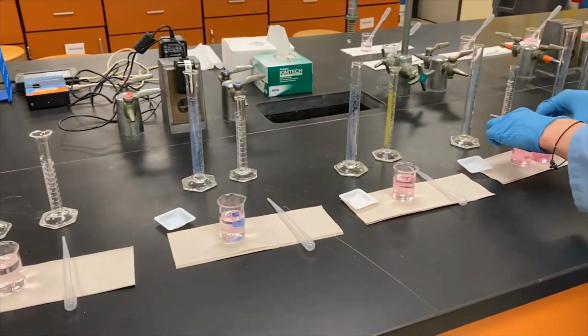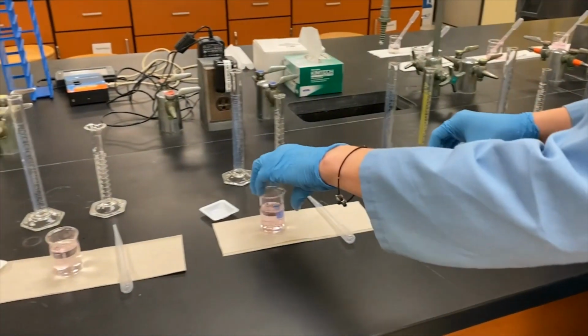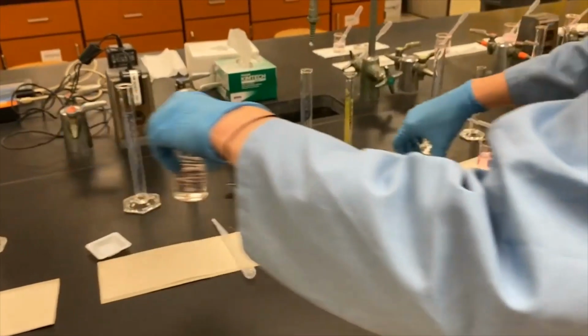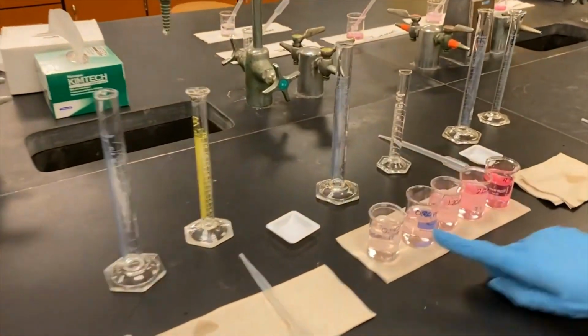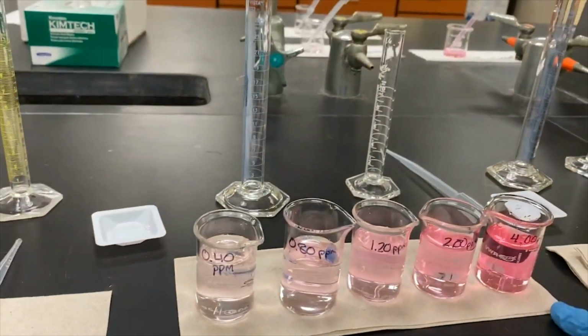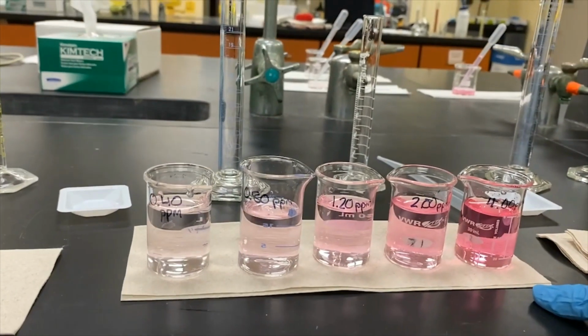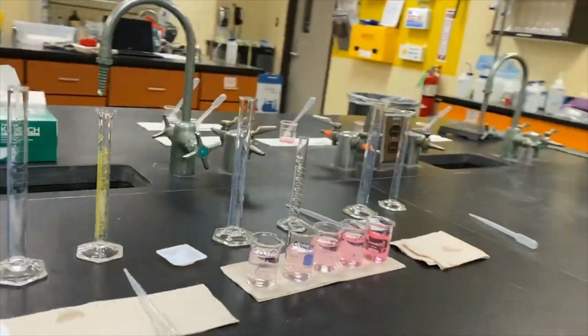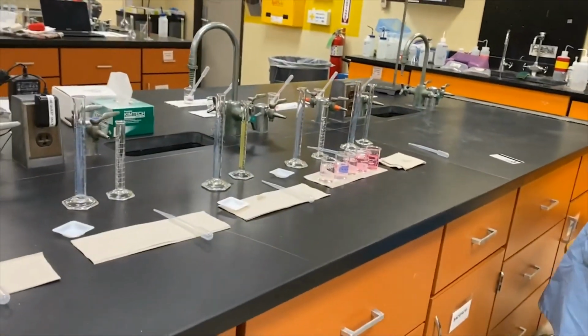So we'll go ahead and give you a nice gradient of our stock solutions here. And as you can see, the higher the concentration, the darker pink we get. Next, we're going to move on to our unknown solutions.